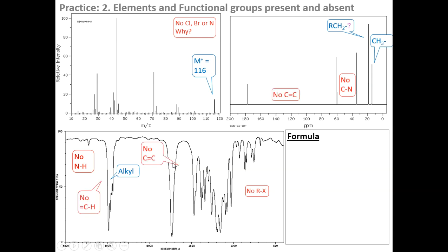And we can very clearly see that there are no carbon-carbon double bonds because there's no narrow, thin peaks over here, medium size, and no medium-sized, narrow peak for the hydrogen attached to a carbon-carbon double bond. We do have a carbonyl peak, and we see that over here, but we can clearly see that it is not a carboxylic acid because I don't have that broad strong absorption peak between 3,500 and 2,500 centimeters to the -1.